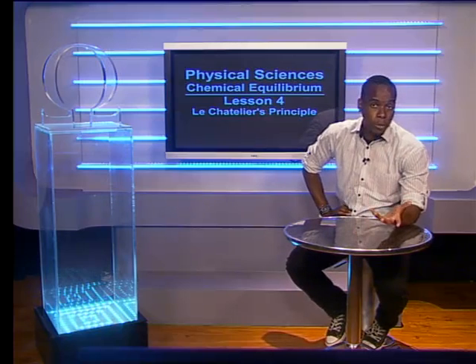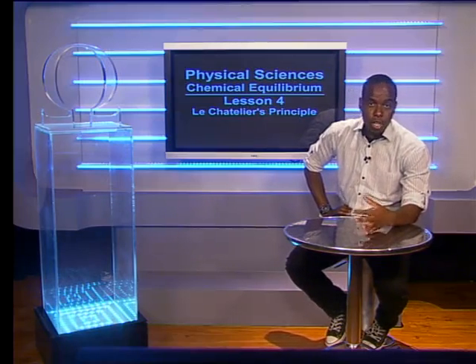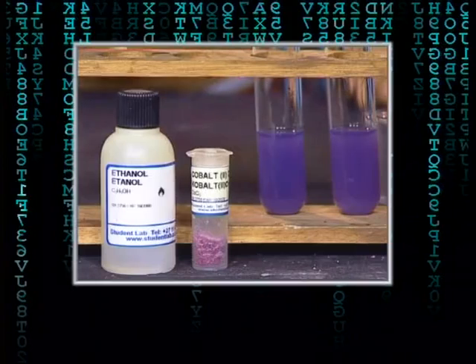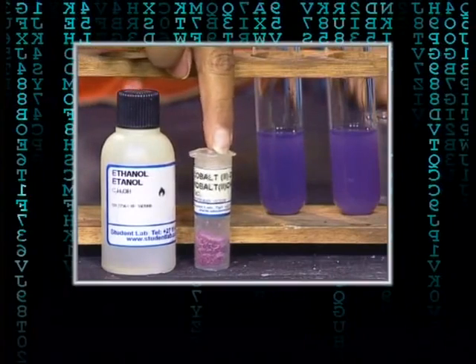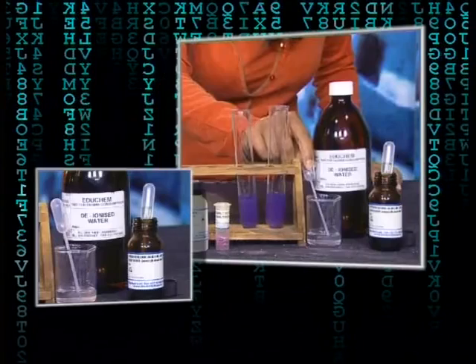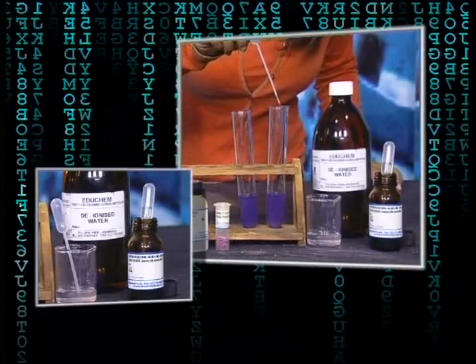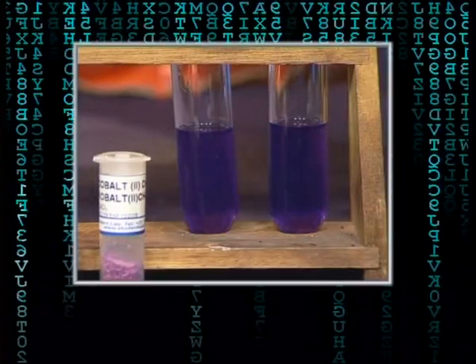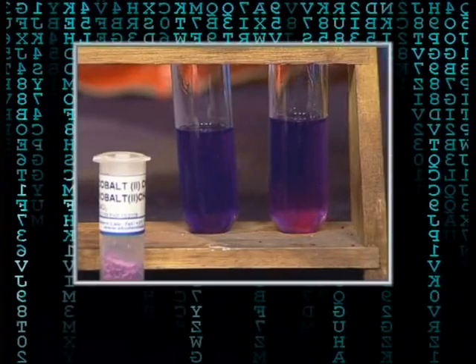Grade 12s, you know what chemical equilibrium is, so we'll start straight away with some chemical magic. We made these two solutions by dissolving cobalt chloride in alcohol. We also added a few drops of water to both of them. Notice that the color of both solutions is purple-blue.